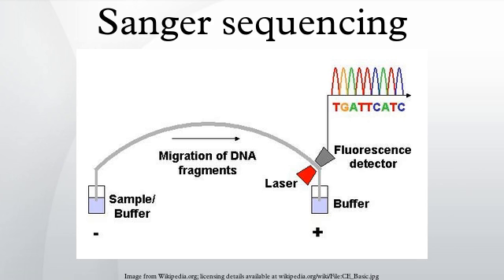In dye-terminator sequencing, each of the 4 dideoxynucleotide chain terminators is labeled with fluorescent dyes, each of which emits light at different wavelengths. Owing to its greater expediency and speed, dye-terminator sequencing is now the mainstay in automated sequencing.